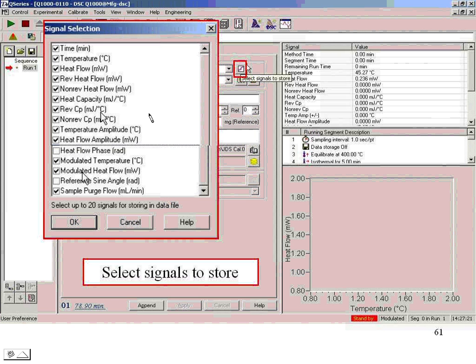And you can see basically I've got them all with the exception of two things stored. And that is how I run the samples. That's what I would recommend doing.